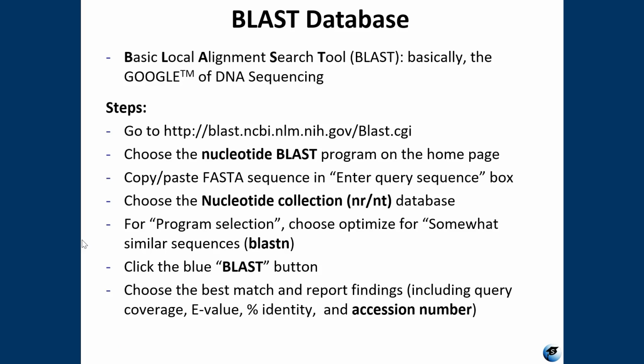So the first thing you need to know is what BLAST is. BLAST stands for Basic Local Alignment Search Tool. It's basically the Google of DNA sequencing. So what you do is you go to the BLAST website. You want to choose Nucleotide BLAST Program on the home page. You're going to copy and paste the sequence that I give you into the box labeled Enter Query Sequence.